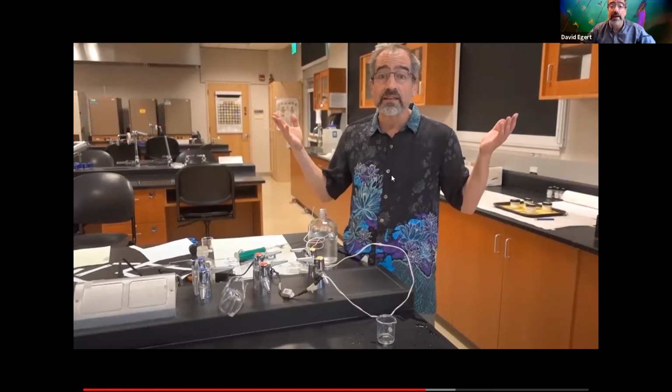So the final part is we're going to now, instead of using a polar solvent, which is water, see what happens if we put an electrolyte in a non-polar solvent. In this case, it's going to be oil. So we're going to do the same kind of thing, look for dissolving, look for electrical continuity. What do you expect if you are going to put salt in oil? Is it going to dissolve?